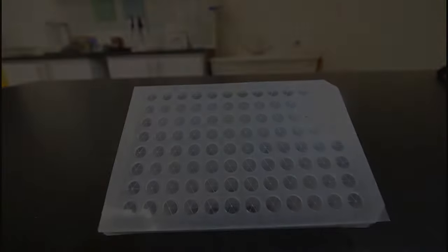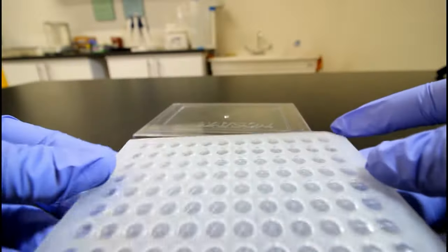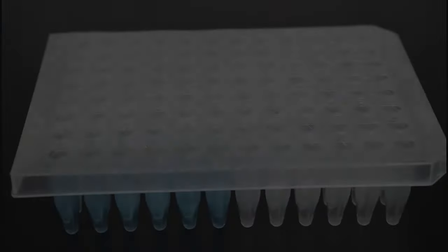The slit seal has a unique triple layer design for easy insertion and withdrawal of pipette tips and sample needles with minimal friction.